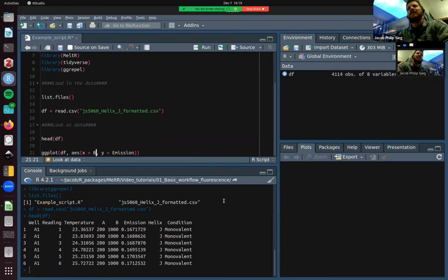And then I want to filter the data set, so I'm only seeing one reading at a time. And I'm going to say reading from here. If we try to look at all the readings at once, it's going to look like a mess. And what this is doing is it's just filtering the data set, reading equals 1.